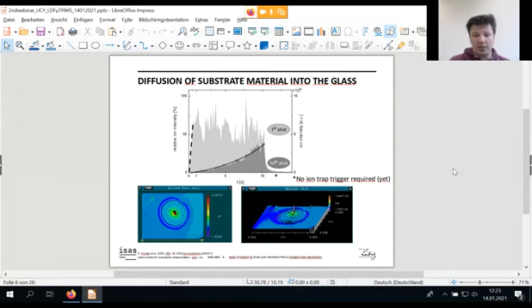And then we realized that the copper is not ablated, so this is not laser ablation, but laser desorption. The copper is not in its original place, but rather trapped inside the glass. It's very weird, because if you apply acids on this copper surface, you can get rid of all of the copper, but not this tiny dot inside the glass, which is basically the melted copper.